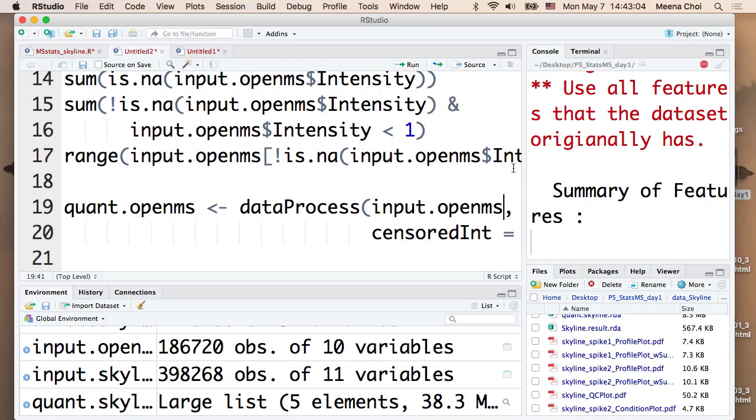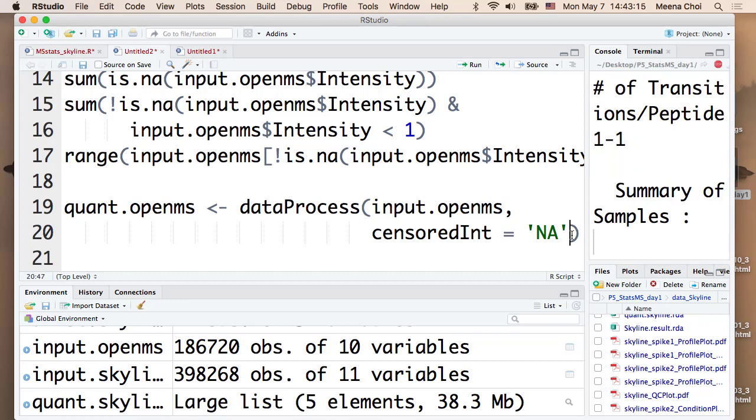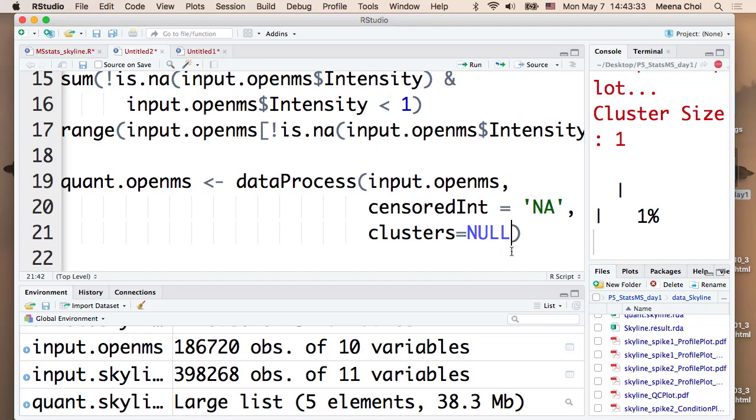Cluster issue, our TA has a different version, 11.7. So after running this, don't forget here, comma, clusters. This is only for people who have had a cluster issue before. I have the solution. You can use R 3.4.3, you cannot use 3.5. Is it fixed? Yeah, you can use cluster. I'm running now.